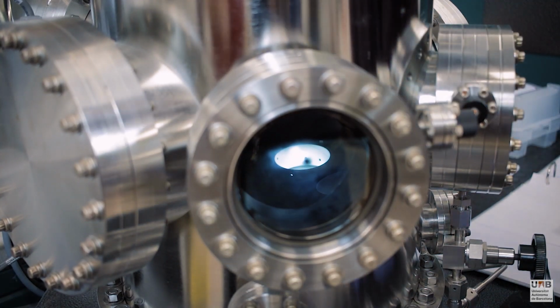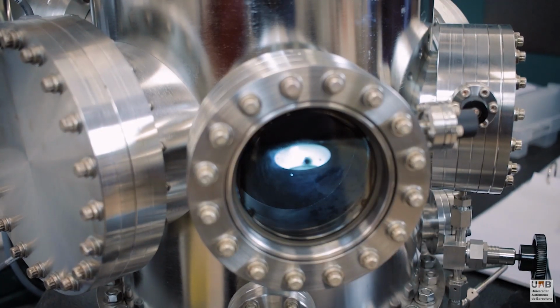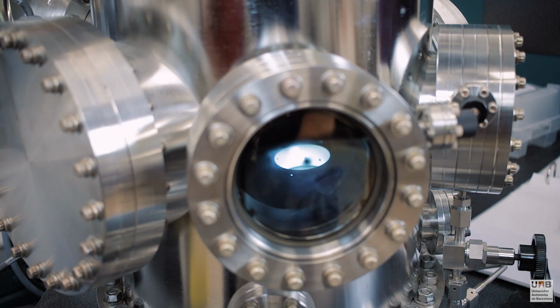And you can now see a plasma flowing in the chamber. That's what this kind of glowing light you see is. That's the argon atoms hitting the target material, and then copper being ejected inside the chamber towards the substrate.